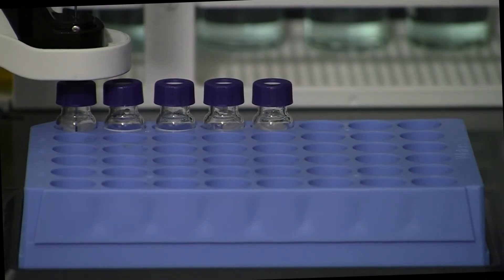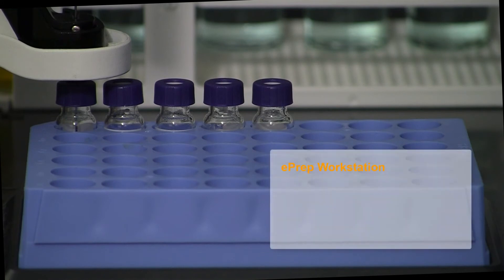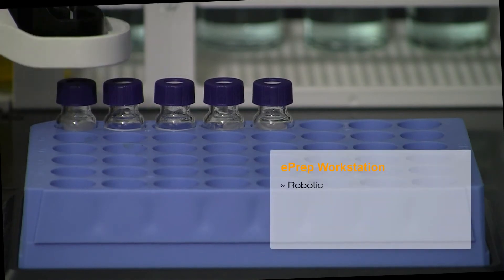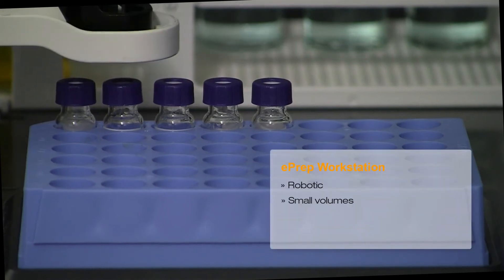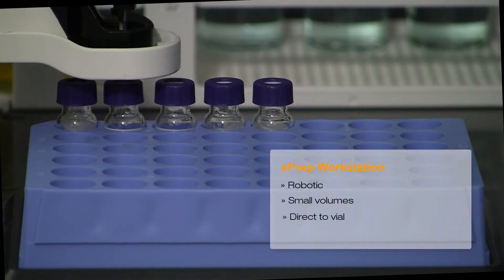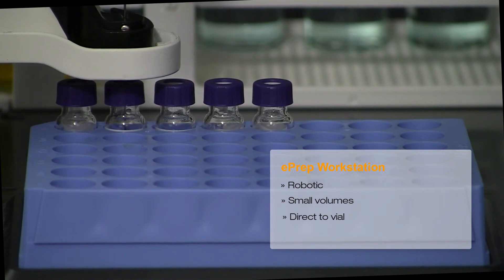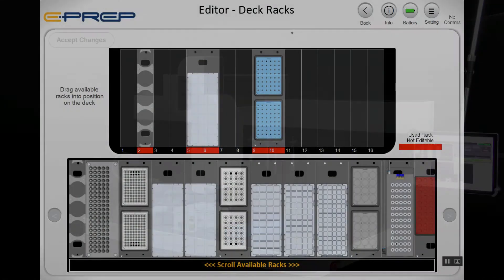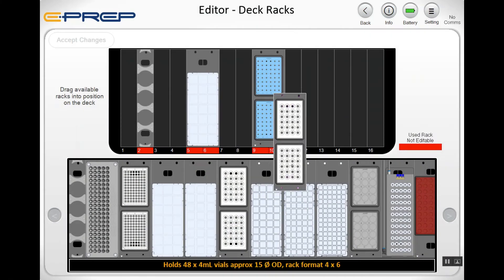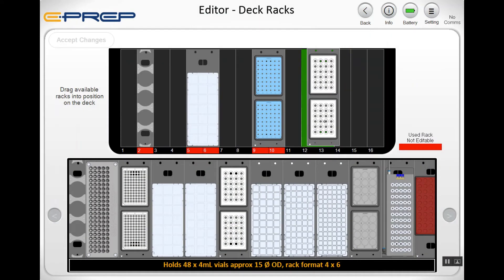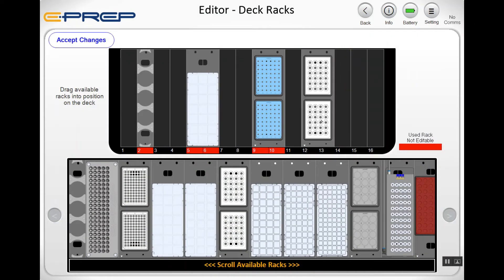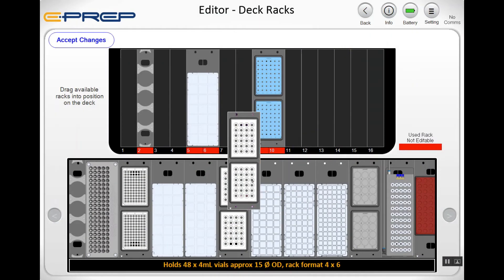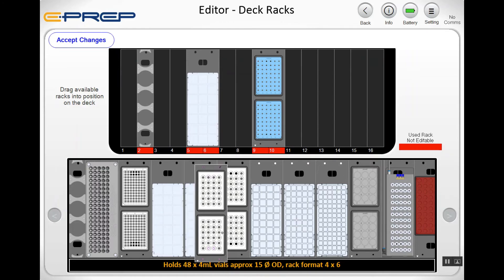The modular deck design enables the user to use any autosampler and sample rack they choose, giving the E-PREP great flexibility to create complex workflows. To make it even nicer, the racks on the deck match the racks viewed in the software through an easy drag-and-drop interface.